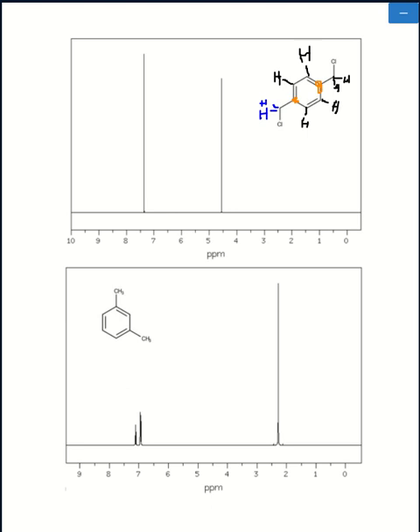Now, when it comes to the symmetry of a molecule, if 2 proton environments are the same based off of symmetry, then you would label them the same. For example, take the protons that are connected to a carbon that is bound to the chlorine atom and to the ring. Well, based off of symmetry, these hydrogen on the right and these hydrogen on the left are effectively the same. Their signals would show up in the same spot on an NMR.